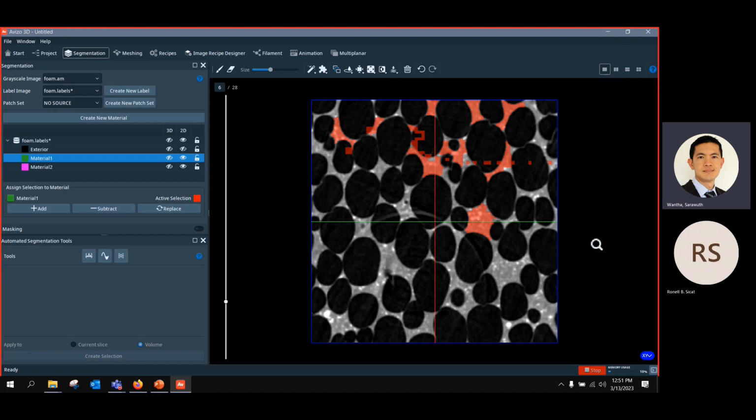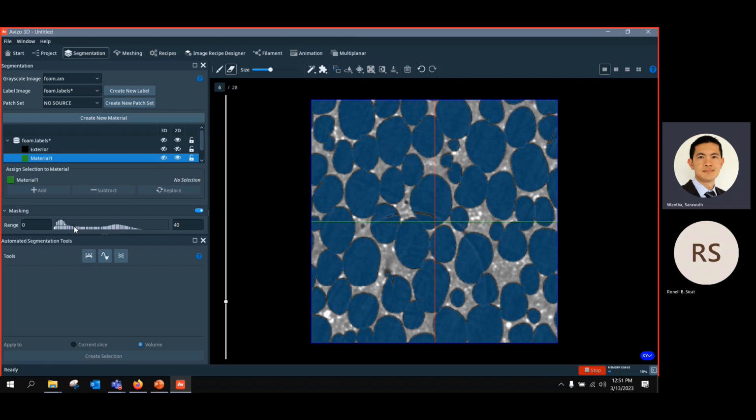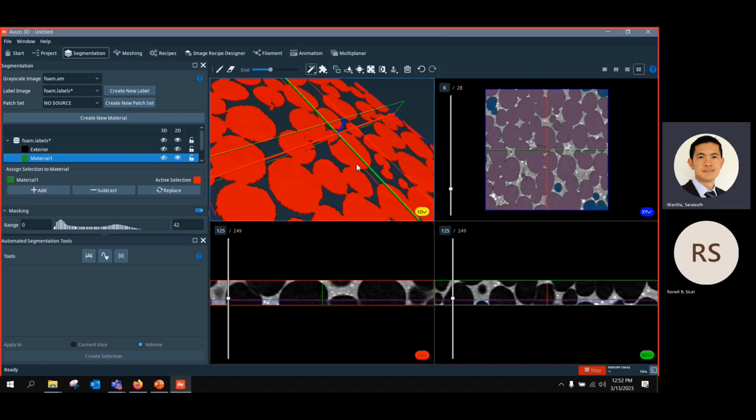So, a quick question from the back. How can we calculate this surface area? For example, you can easily use this magic wand tool, and maybe I clear first like this. Okay, and adjust the threshold. For example, I have the bright and the dark. So if you just select with the magic wand only this area, for example. Okay, and you can see that in here.